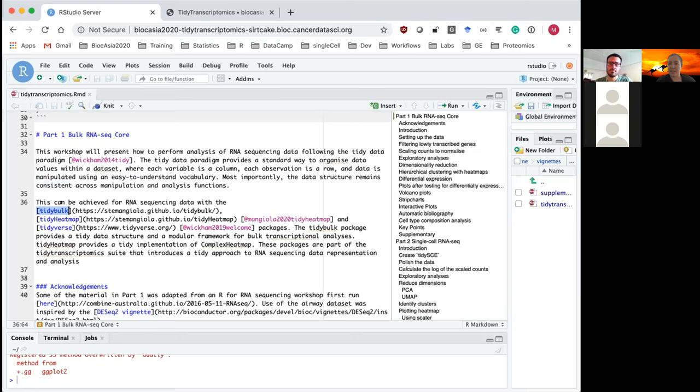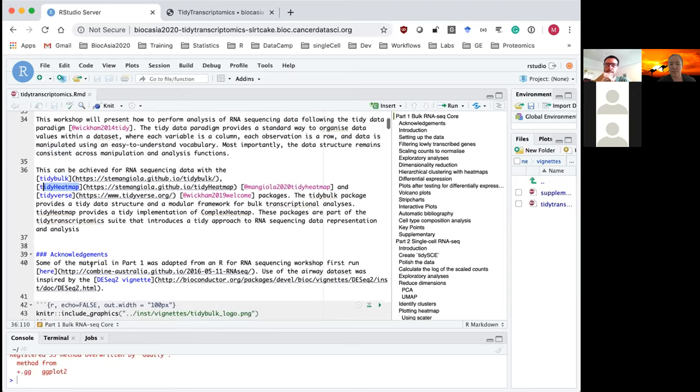This can now be done for RNA sequencing data using the new tidybulk package added to Bioconductor this year. It's a package created by Stefano, our co-presenter, and we'll also see the tidyheatmap package being used.